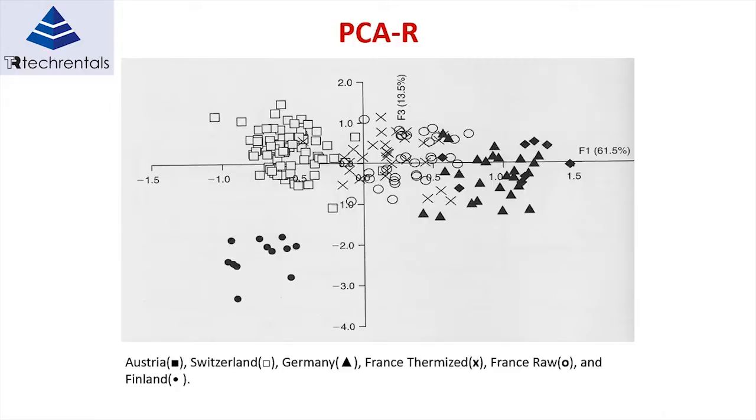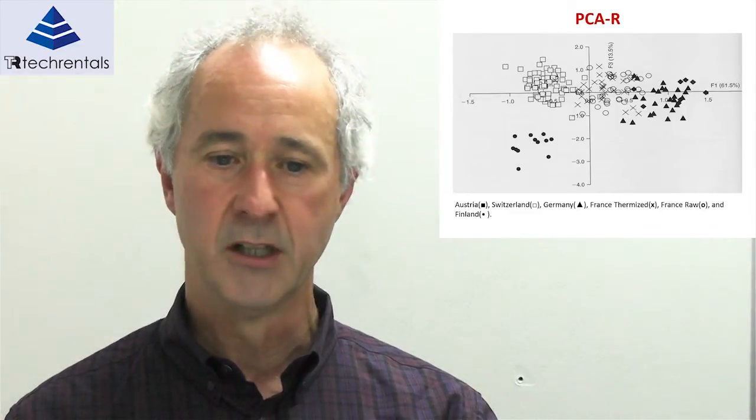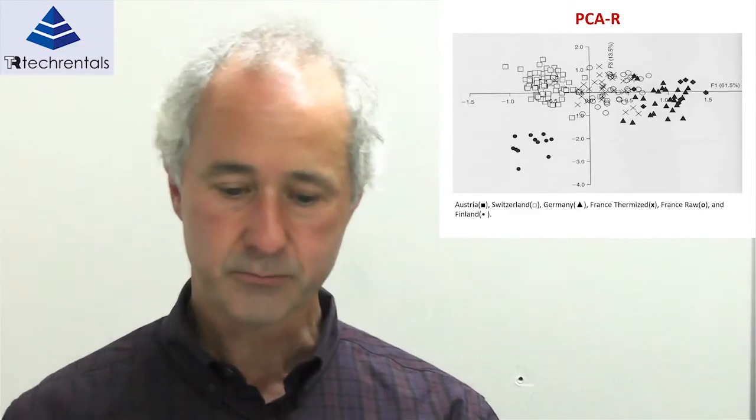Now they'll try and sell their Finnish cheese at a premium, but someone else comes along from Switzerland and says, well, this is the same brand of cheese and we'll sell this as Finnish cheese. And this is a big issue in Europe for country of origin determination. So with principal component analysis, you can see here you could easily determine Finnish cheese from any of the other European brand cheese using near-infrared spectroscopy and just using a qualitative analysis.